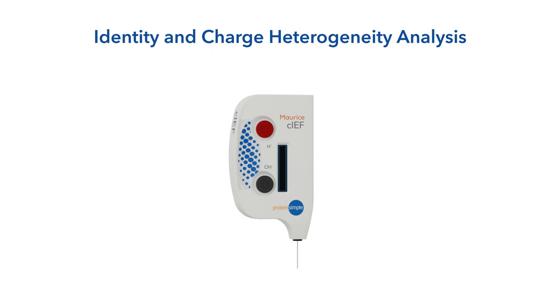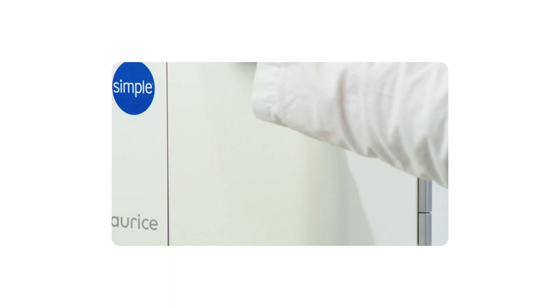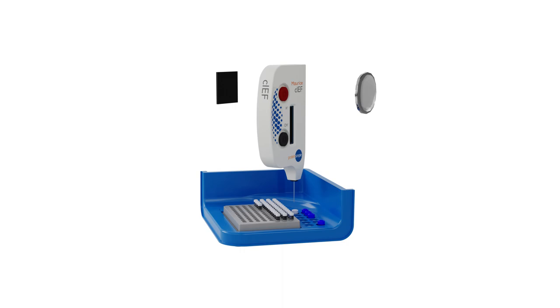Now let's look at identity and charge heterogeneity analysis of your biologics with CIEF. Simply add electrolytes into the tanks of your cartridge and insert into the Maurice. Load your samples and reagents, then close the door. The sample is injected into the cartridge based on the location you define in the batch.